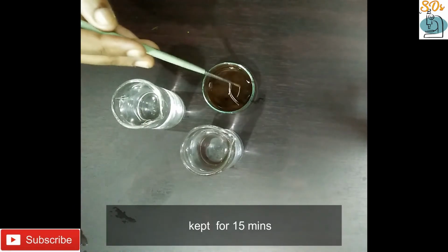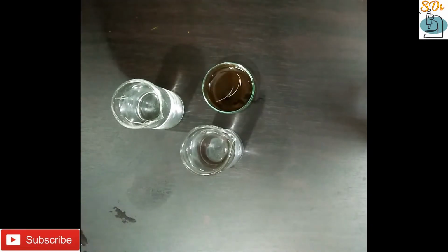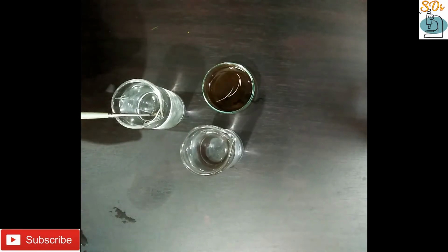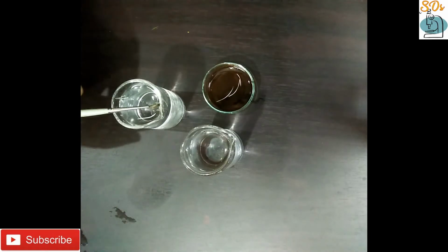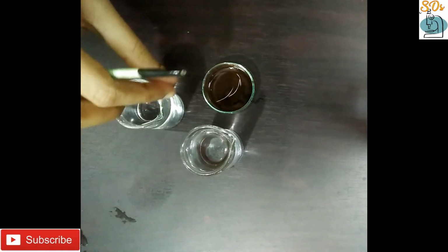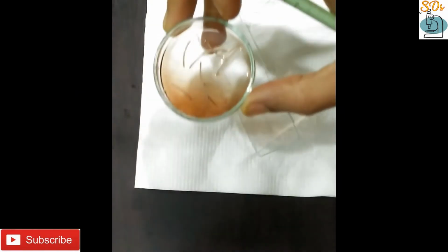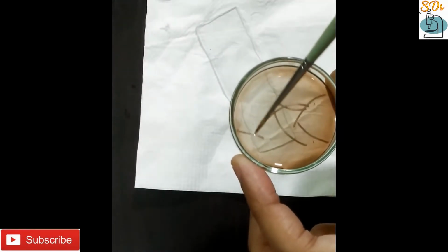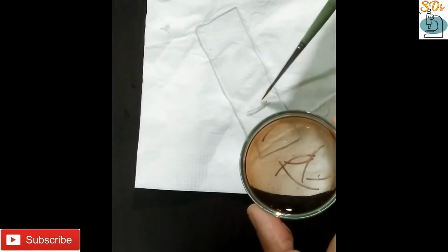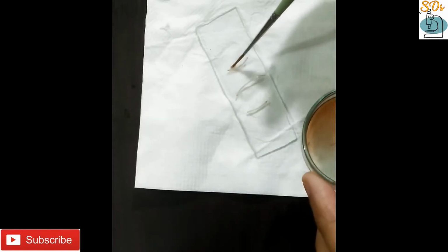Incubate the roots for 12 to 15 minutes. During the incubation, the very tip of the root will begin to turn brown. We can use Feulgen stain also in place of acetocarmine stain. During the incubation, the very tip of the root will begin to turn red in the case of Feulgen stain. I am taking a brush to pick one root and set it on a new glass slide. I am taking 3 roots.